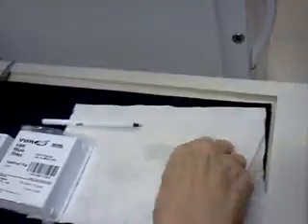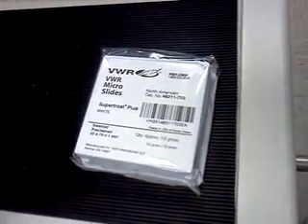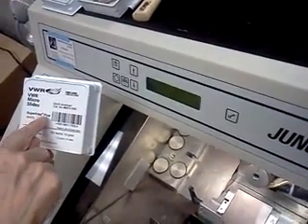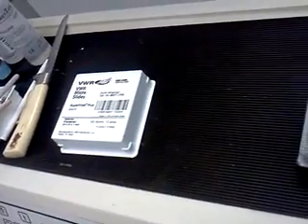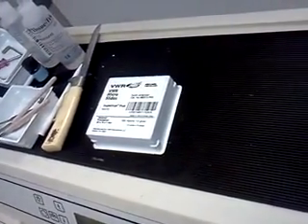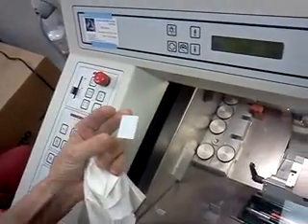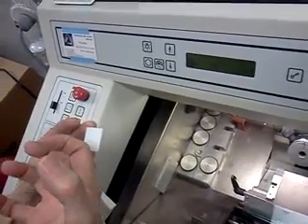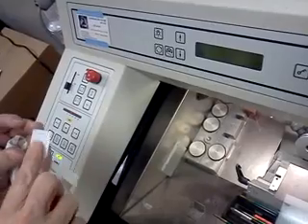Okay. Alrighty. Now, these slides are particular slides. They're not just any old slide, like you would use, say, in the biology department or the labs downstairs. These are special slides. You'll notice they say Super Frost Plus. The reason we buy these is because they have a coating on them that makes tissue adhere to it better, so that when you're doing immunohistochemistry, the tissue doesn't fall off and glide, which happens a lot. If you look at the slide closely on the bottom of it, there's a plus plus. That's what they're talking about. They're Super Frost plus plus slides. It means that it has an ion or something on it that causes the tissue to adhere to the slide tightly. There's a little coating.